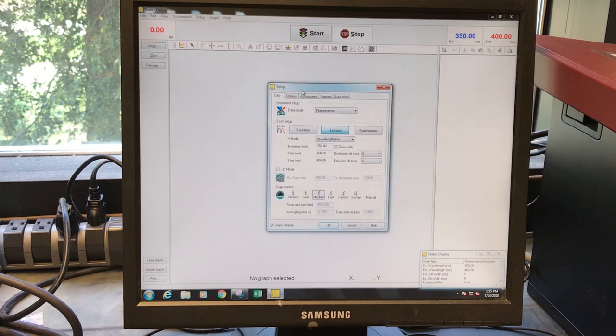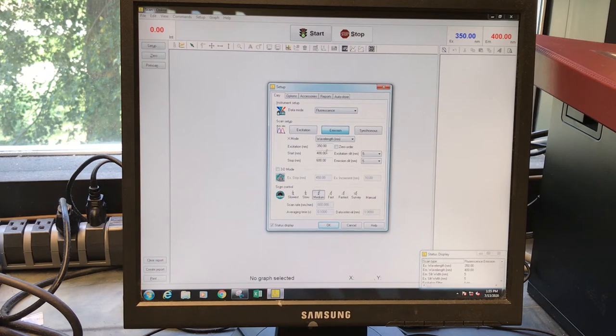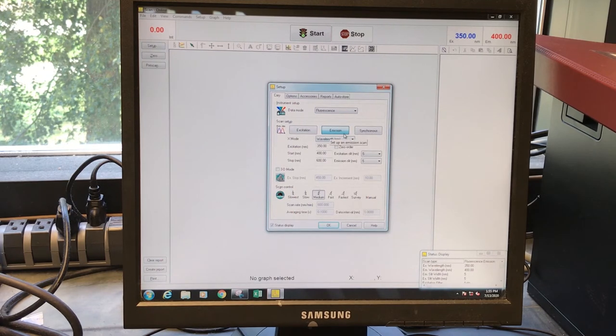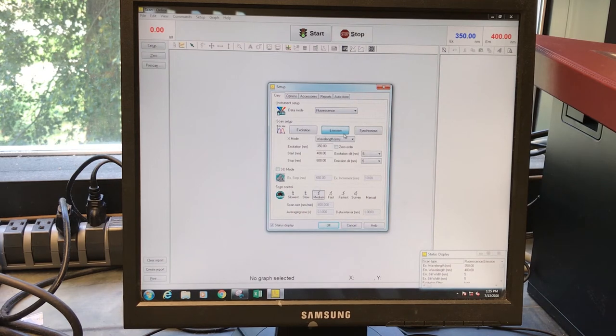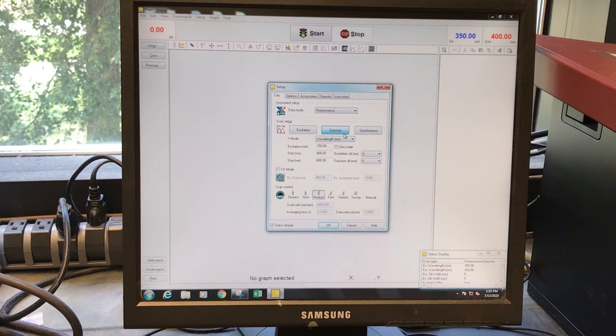So you can click Setup. And this is where you can play with some of the parameters for an emission scan where we excite a sample or molecule at a particular wavelength and then scan a range of wavelengths and collect the emission spectrum.